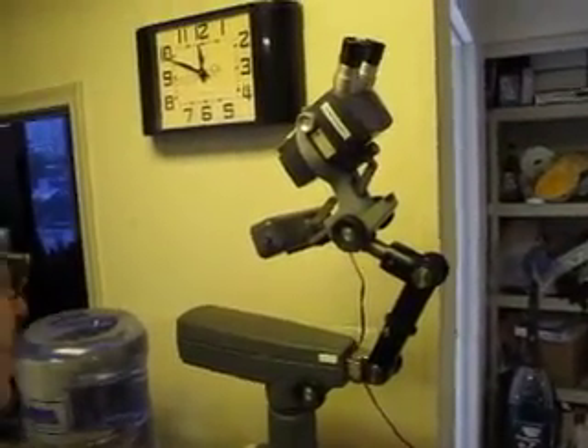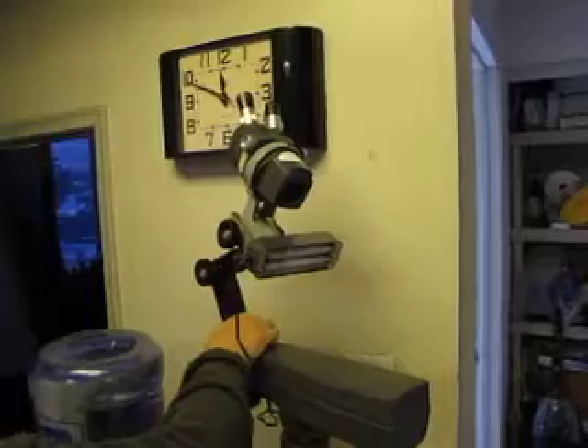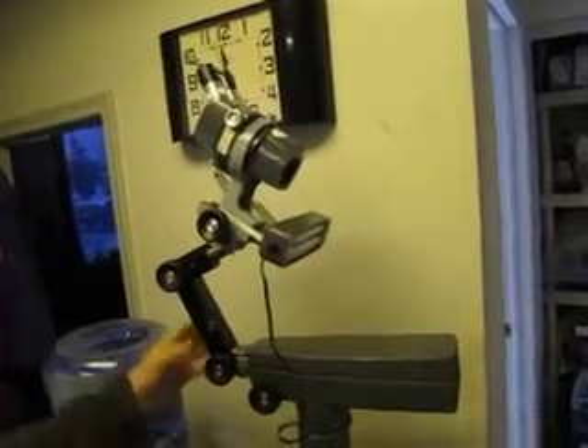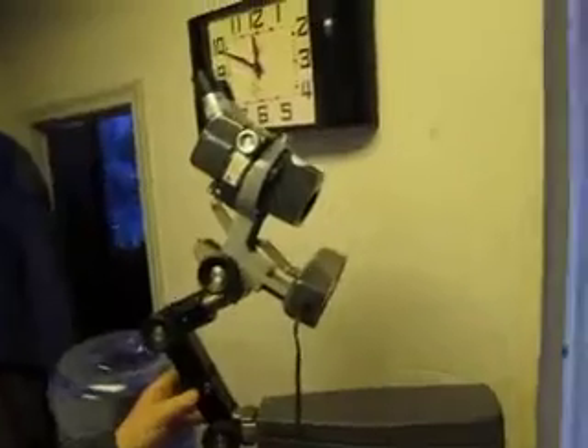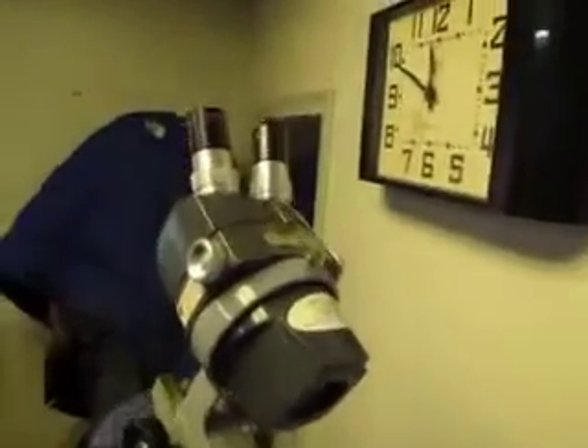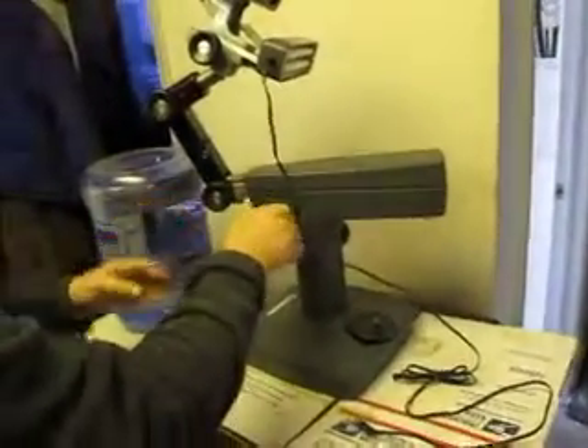This crank here goes up and brings this up and down. It does a 360 — pretty nice outfit. All this stuff articulates. I've got pictures of the date of repair and everything.